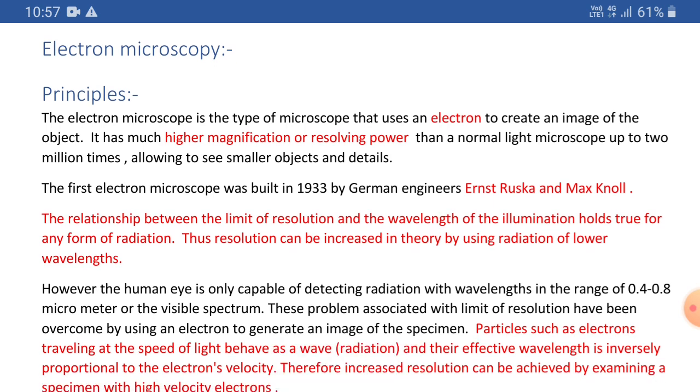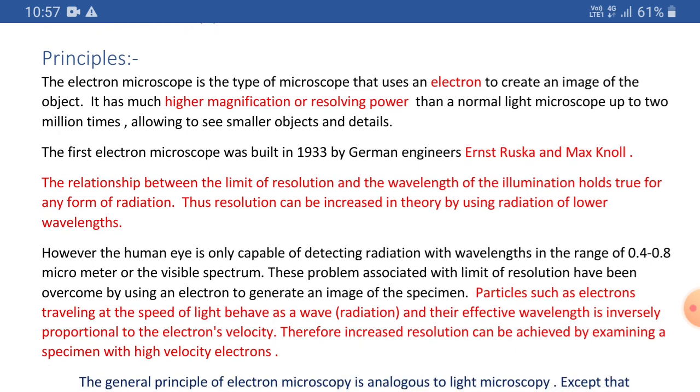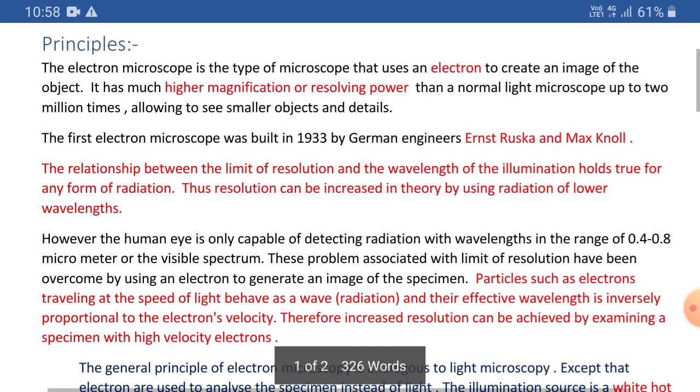As a result, in that microscopy we get a lower illuminated final image, but it helps us detect the biological specimen live. But here another problem arises: as we are using too small an amount of light, the artifacts, that is, the impurities present due to some technical error during specimen preparation, cannot be distinguished from the cell. In such a low resolution, low light image, you cannot tell what is your specimen and what are your artifacts. So scientists again thought about how to solve the problem associated with dark field microscopy.